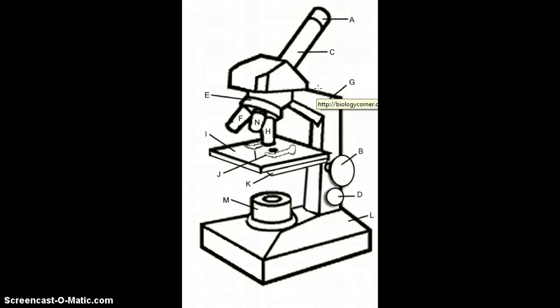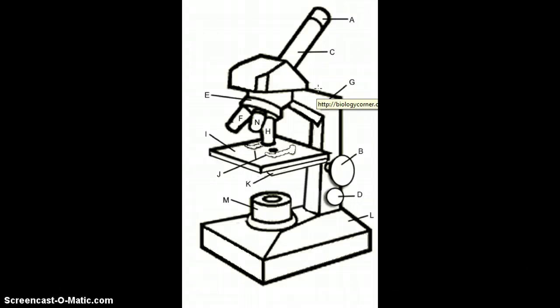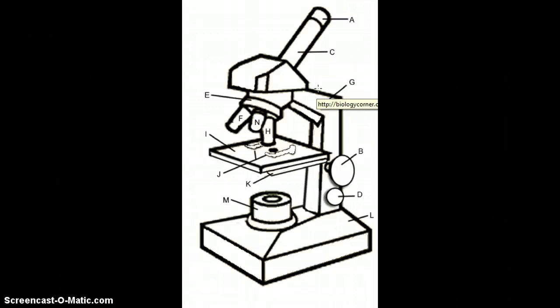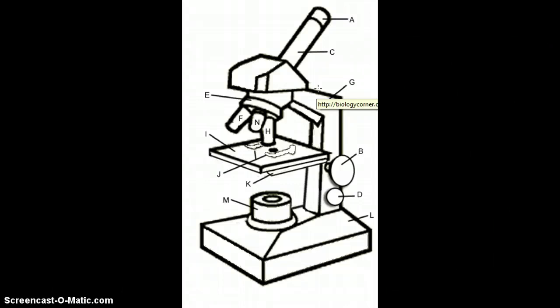The objective lens, often called objective for short. The shortest of the three objectives is a scanning power objective lens and has a power of four times. The second objective is the low power objective, which produces a magnification of ten times. The high power objective lens has a magnification of 40 times.